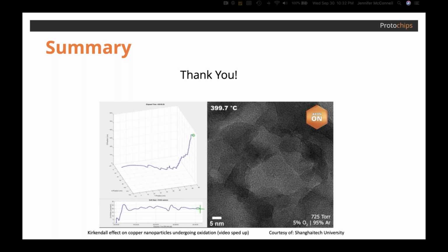One thing I want to mention in closing as we sign off is AXON itself has quite a few applications, as it was designed as a machine vision platform for not just in situ microscopy, but microscopy in general. We've done a number of these webinars over the summer, and many of them are applications based. If you're interested in seeing how AXON can be used with specific applications, please visit the Protochips YouTube channel. We have a variety of experience videos that go into detail on the software, and other webinar sessions that explain some applications. You're welcome to take a look at those at your leisure.